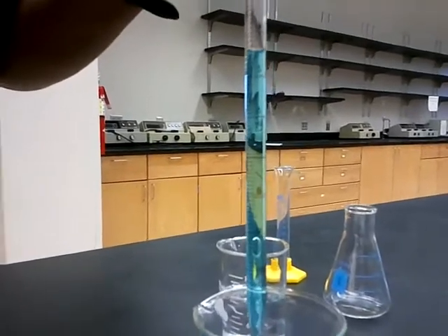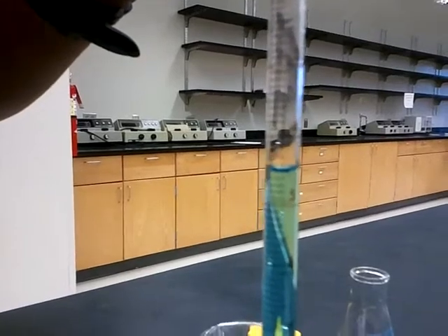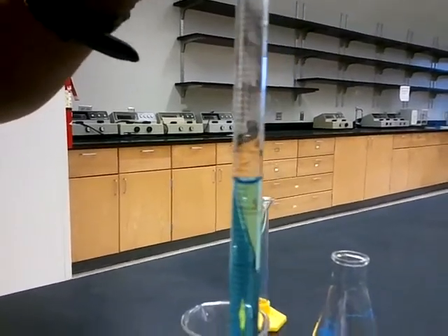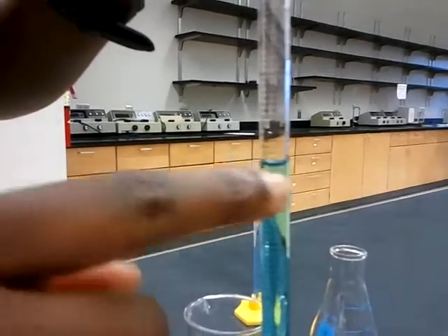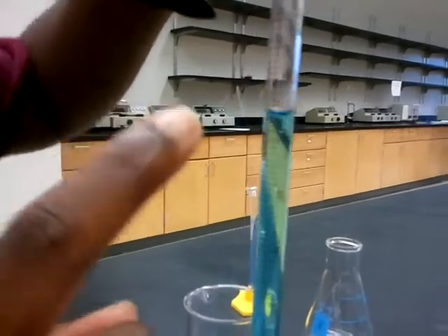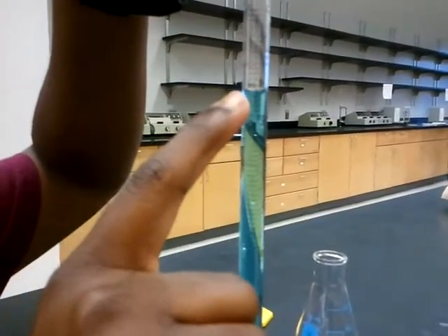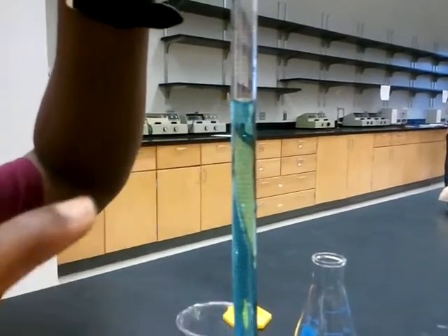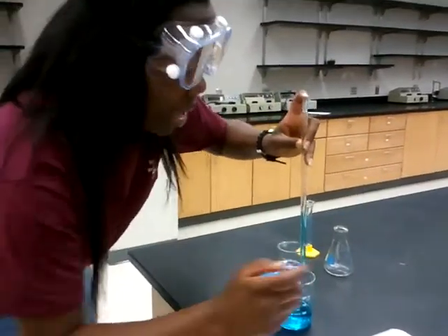Alright, so here we're going to measure at about 44.2, and in measuring our meniscus, remembering that the meniscus is the curvature of the upper part of a standing body of liquid, we pay close attention to the very bottom of that, which will be right here at the bottom of your curve. And that's where we get our 44.2. Okay?